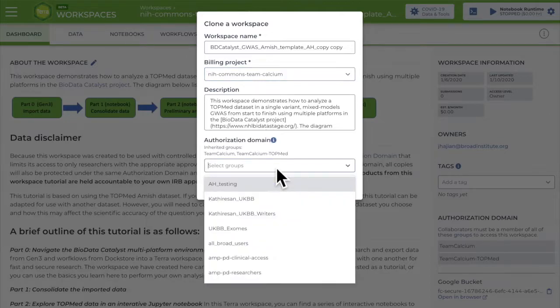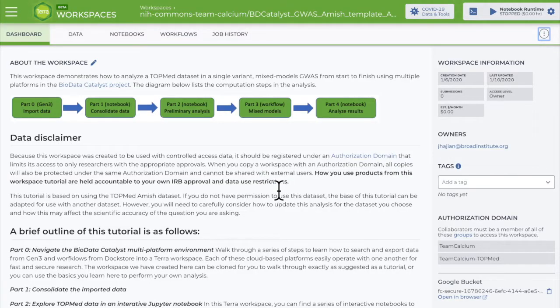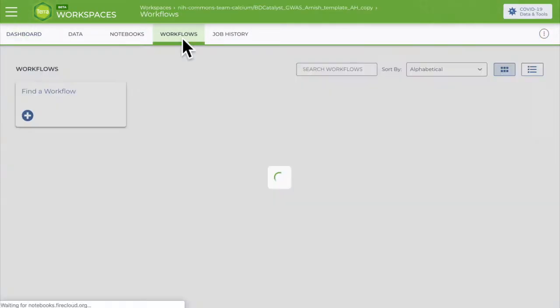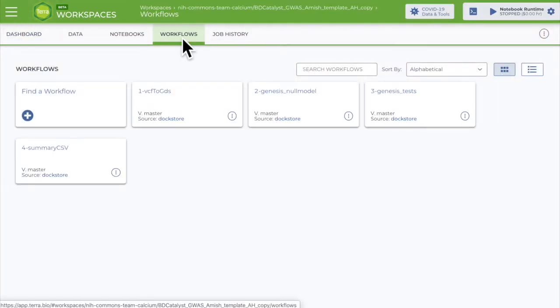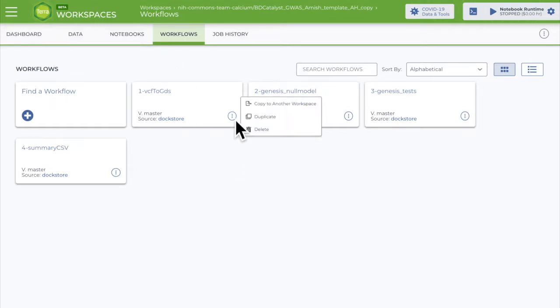On a side note, the three vertical dots are an icon used many places in Terra, often to copy, share, and delete. For example, in the Workflows page, you can copy a workflow to another workspace and duplicate or delete it in this workspace using the same three-dot icon.